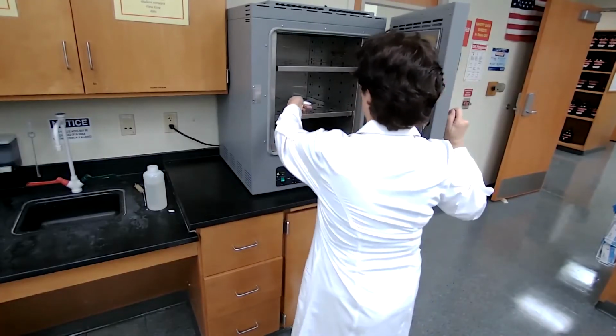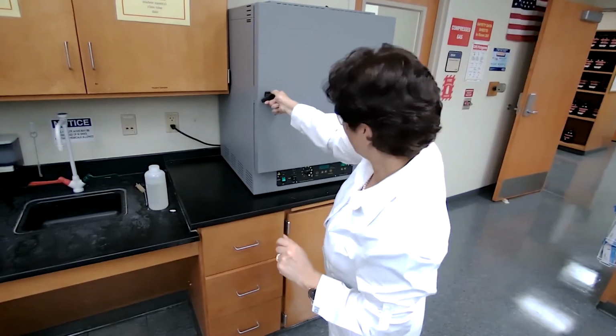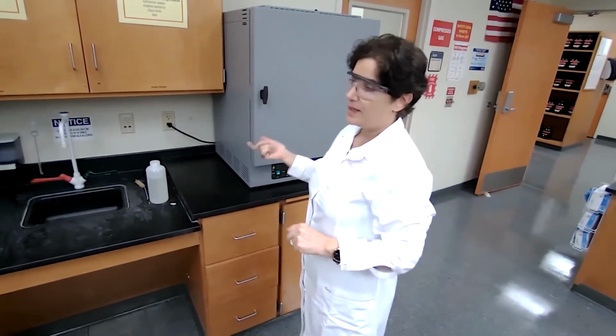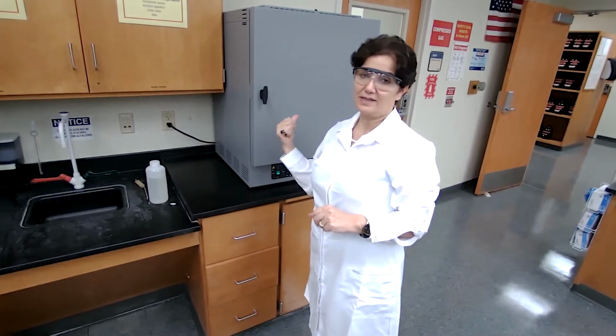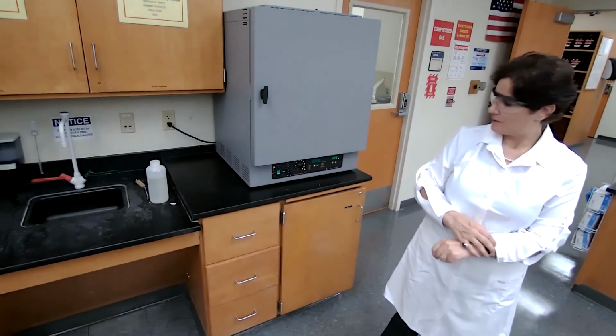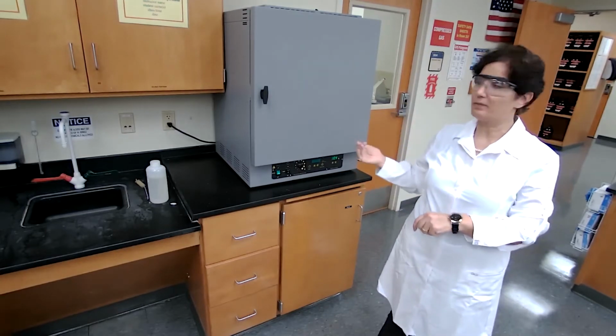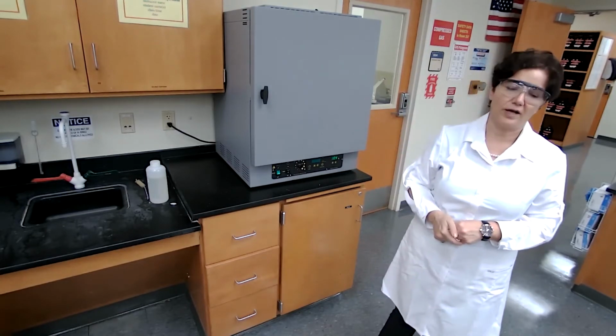The sample is in the oven for about 5 minutes to dry. And while this sample is drying, we're just trying to be efficient. We are going to go and look at our ether solution. If the ether has evaporated completely, we can measure the melting point and mass of the sample. Okay, we're just going to take the time, about 5 minutes, or we are going to heat until it's dry.